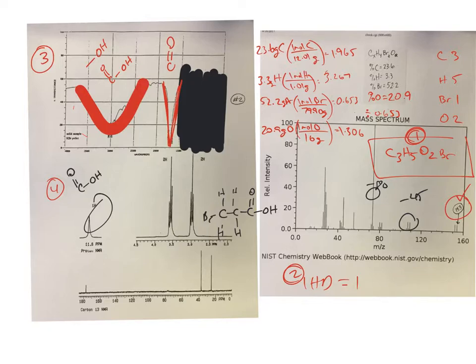So then I would go straight to my IR, and while there is other useful information, notice how I've annotated this one here, right? I blacked out everything below 1500. Not because it's not useful, because it is, right? That's that fingerprint region that you can totally ID compounds with, but only if you know what you're looking for, right? And we don't. We don't know what this is. We don't know what that chunk of the spectrum should look like. So then it really just becomes a distraction.